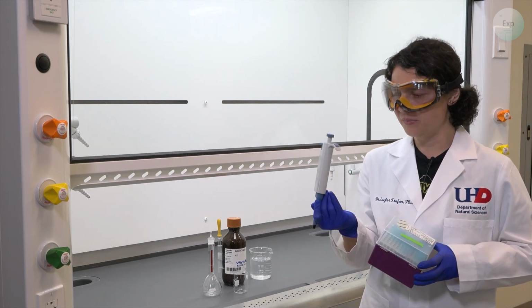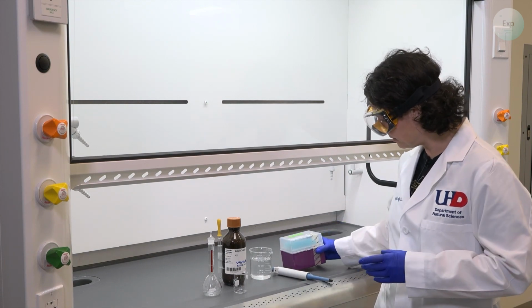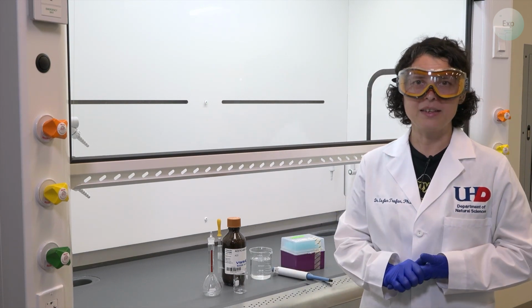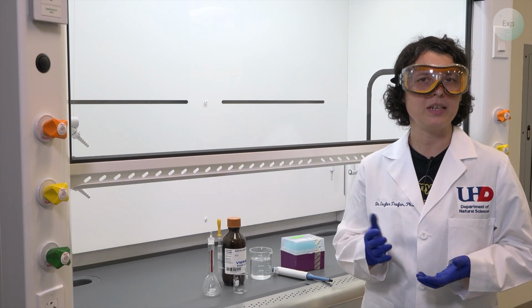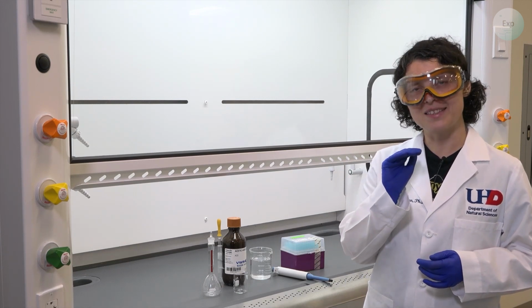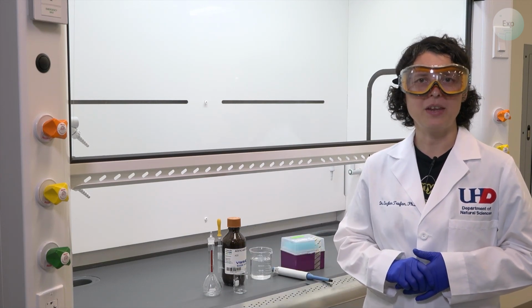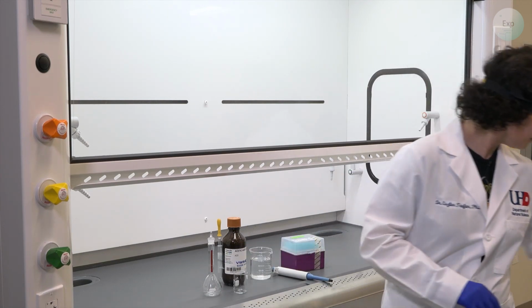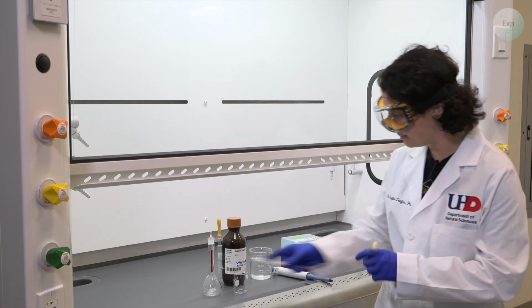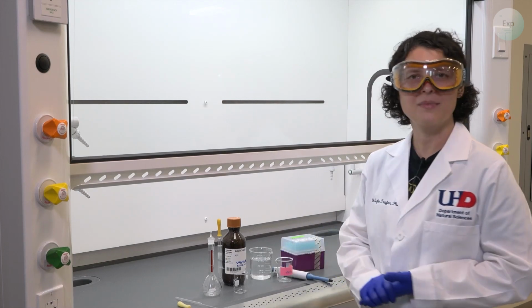For the micropipette, we need the micropipette and we need some clean tips. And finally, because the tips need to go somewhere, we need a waste container. And because we need the volume to be exactly at the mark in the 100 milliliter volumetric flask, we will need to use a pipette. Let's get started.